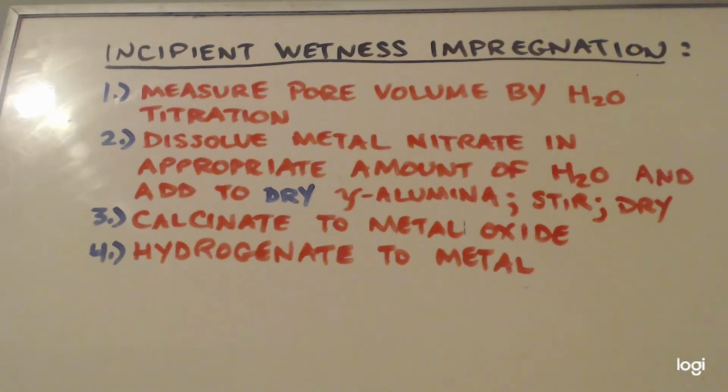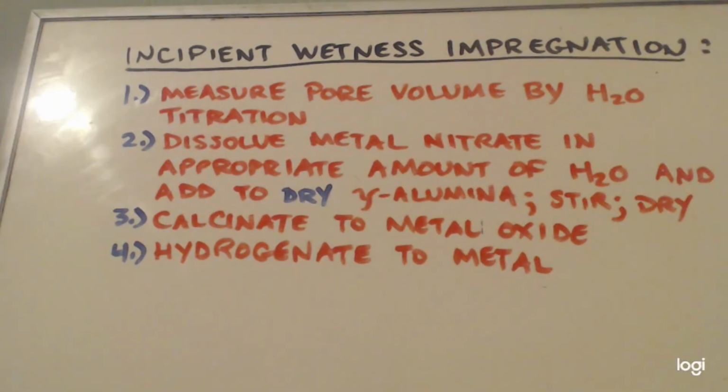I will keep lengthening the condenser on that first trap until I can get everything out of there so it doesn't overrun the bubbler where the vodka is and go past that. I don't want it to go past that, right? Because that's where I want it all to collect. That was the problem I had. That was why I was going slow in the video, because there was so much gas coming out of the furnace so fast that it couldn't all be condensed. It was going past the first trap, past the bubbler, and it just couldn't be contained. That was why I went slow in the video.